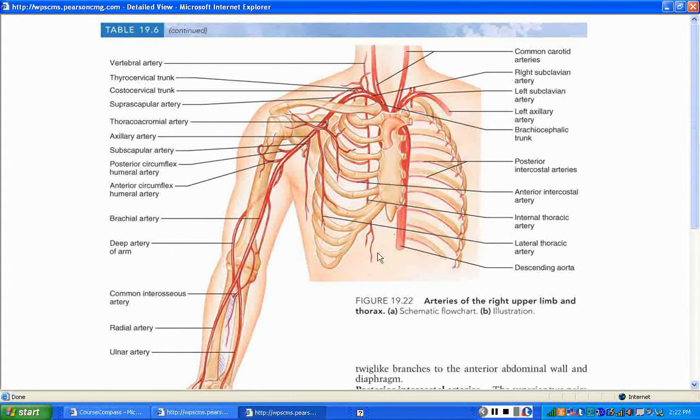Here's what you'll notice. This looks like a candy cane. What is it? It's the aorta. Only arteries have an aorta. If you are looking at a chest shot and you see an aorta, it's an artery picture, all right? Because they separate out the arteries and veins.